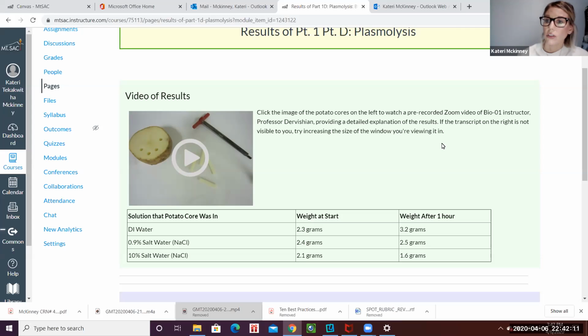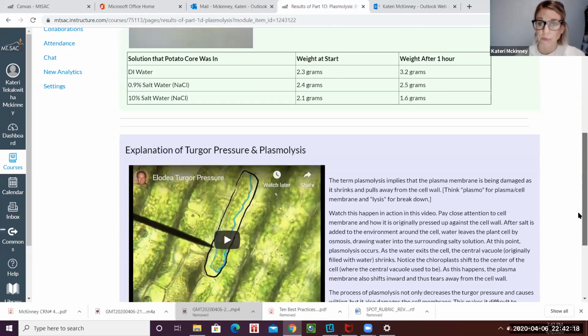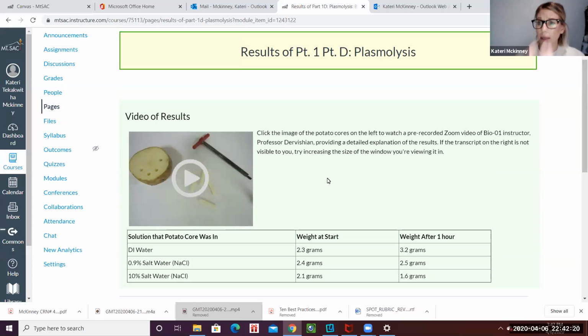So what do you think is going to happen over time if we drop these potatoes into the solution? Eventually the water is going to get pulled out of these potatoes. You weighed them at the start. You would have weighed these potato cores, and they are at varying weights because we didn't make them exactly the same size. And then over time, you can see what happens to the potatoes.